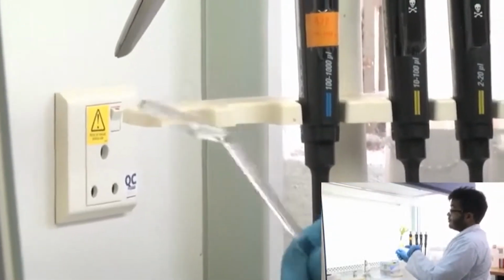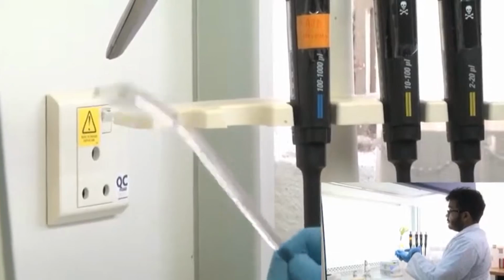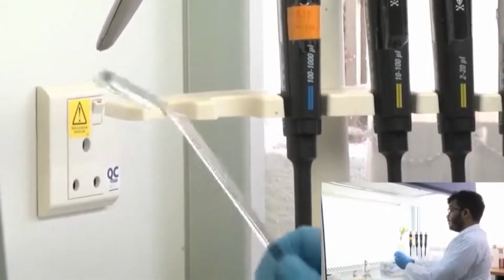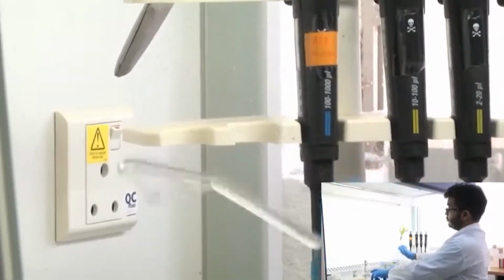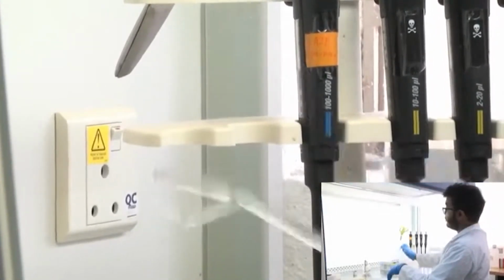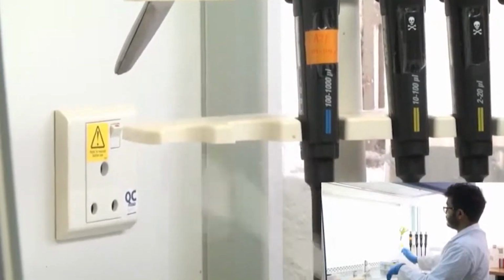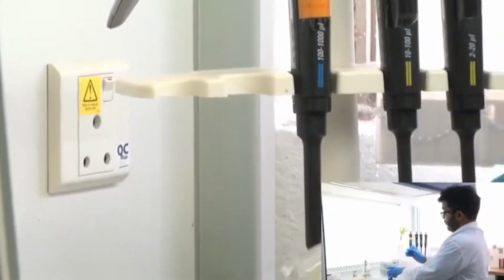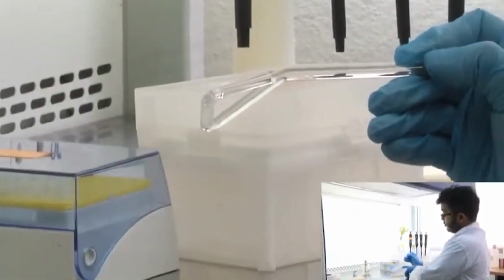But now the spreader is hot, it's very hot. If you use this and dip it into the culture that you put on this plate, again you're going to kill your bacteria. So just cool it, keep it out for at least a minute, around a minute. What I do is I just wave it around to cool it, and then, see, I added the culture to the middle.